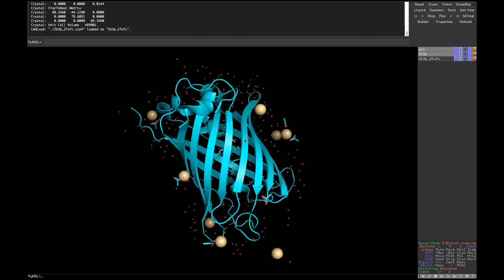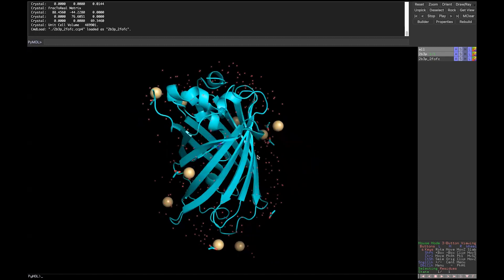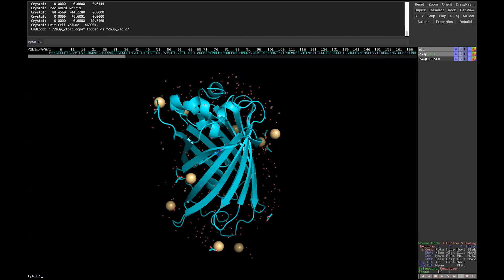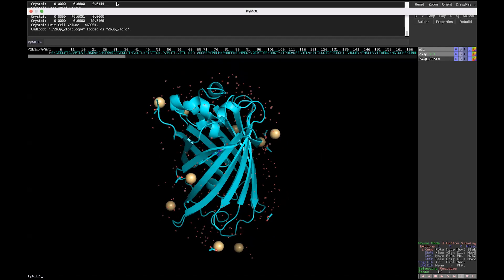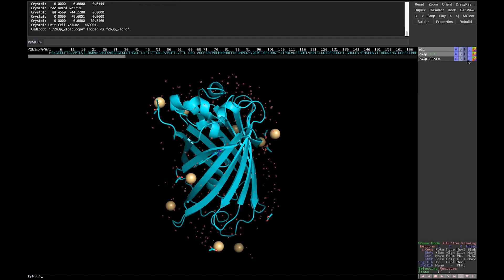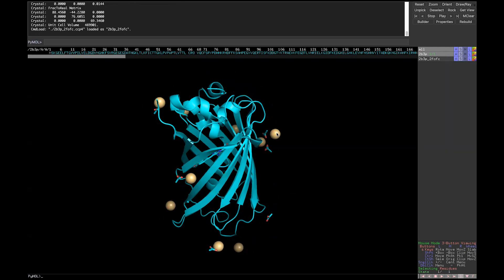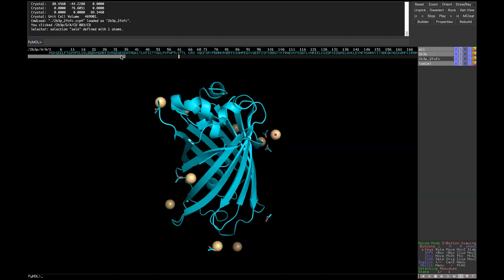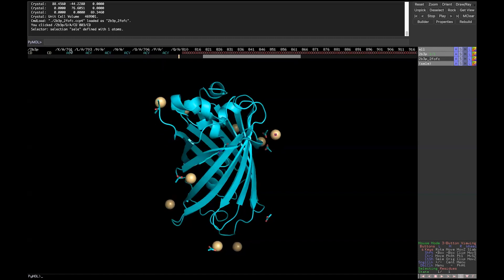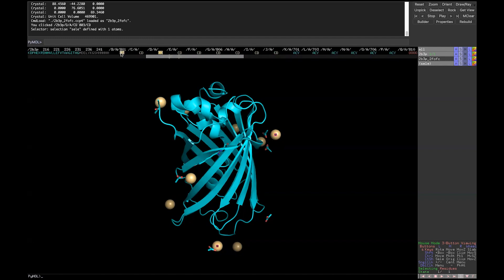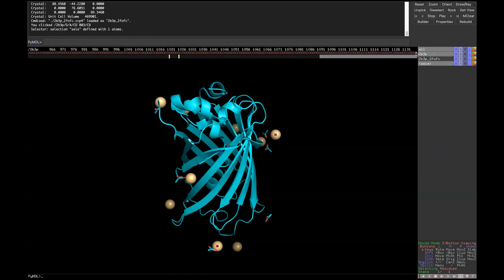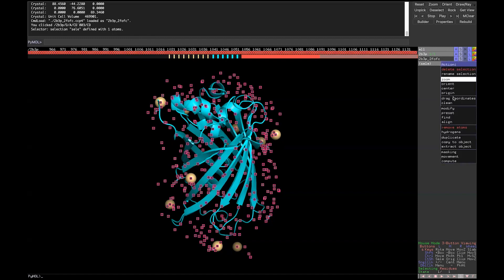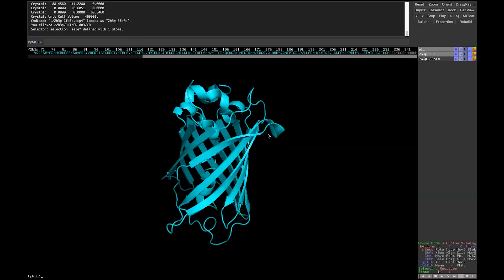To make things easier to see, I'm going to turn on the sequence view — you can press the S button at the bottom or use the menu. Those small dots represent water molecules, which we're going to hide. We'll also hide the acetic acid and other small molecules. You can select them and use Action > Remove Atoms. Now we've simplified things and we're just seeing the protein structure.